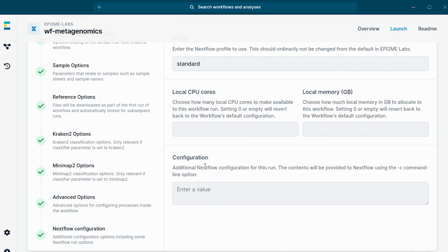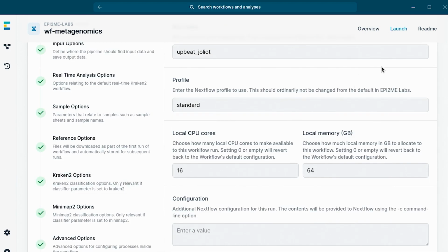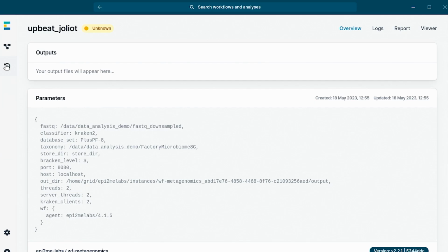And there are other options also that you can customize. And then let's take a look at the report that you will get. We have generated a report earlier today, so we are going to speak a little bit about it.